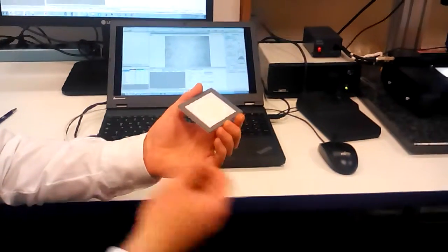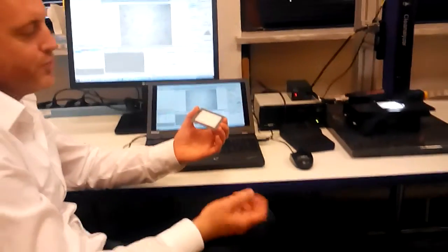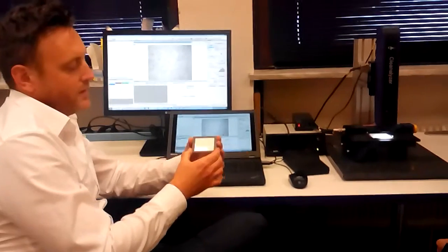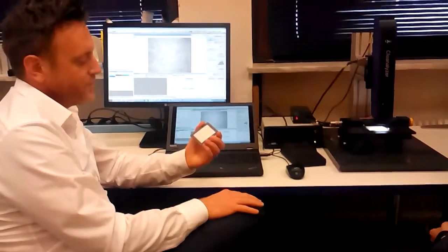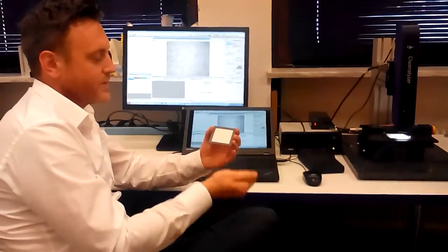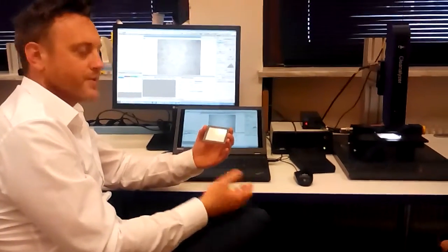So typically a manufacturer would take his part, wash it using a very specialised procedure, then drain that water through a filter paper such as this, and the residual dirt would be captured onto this filter paper. We are then analysing this filter paper for all of the particles that are on here, both for size, for type, for concentration and numbers.